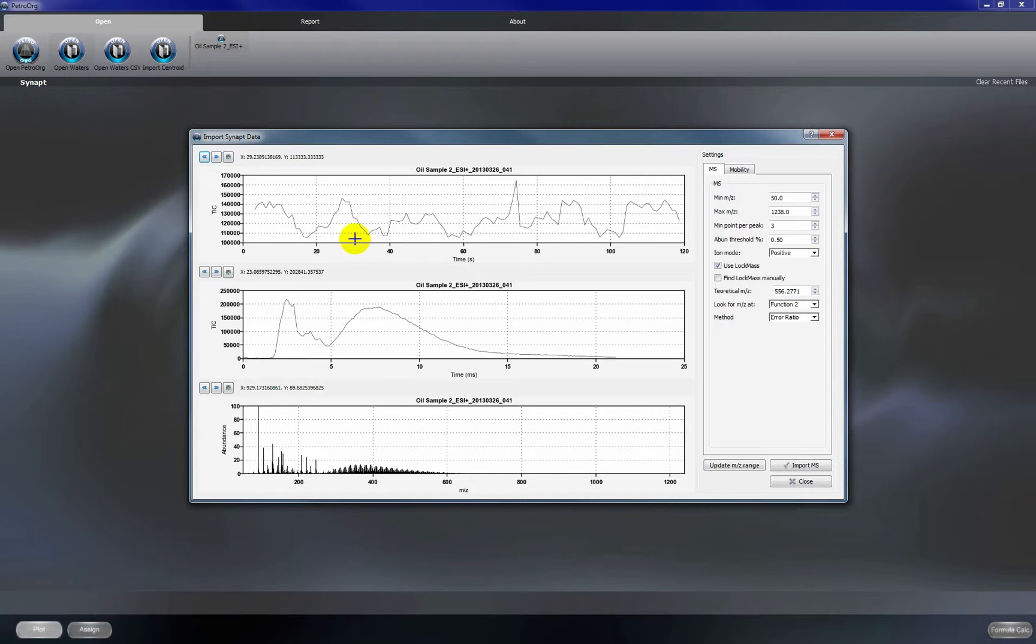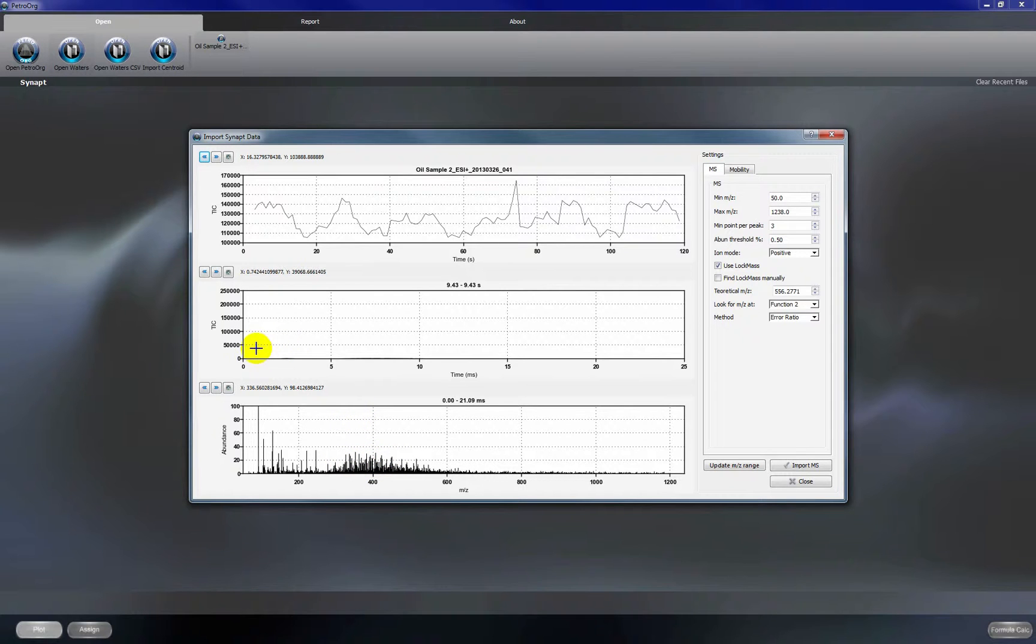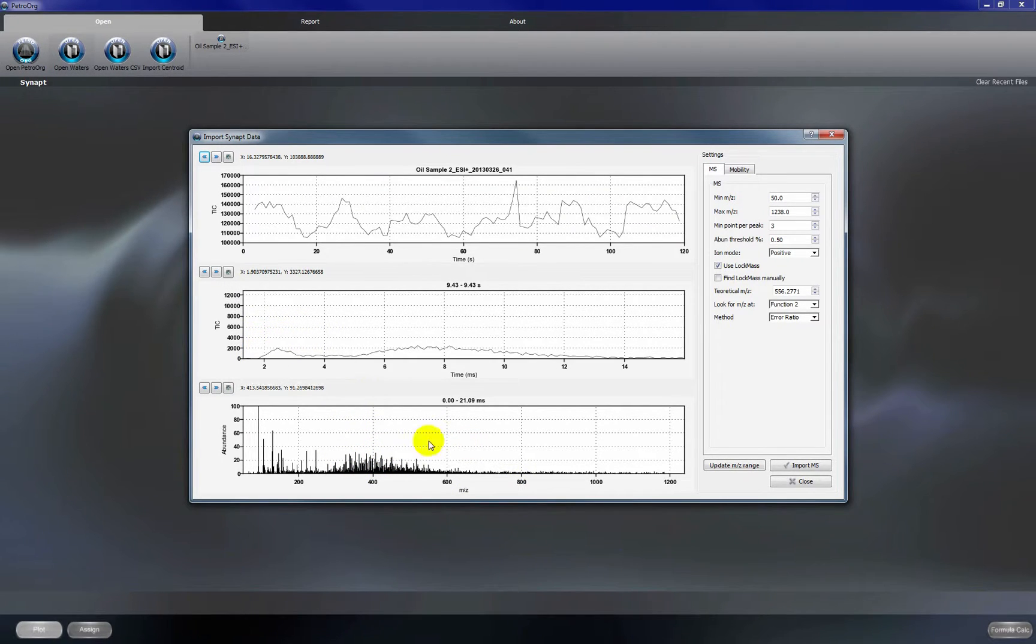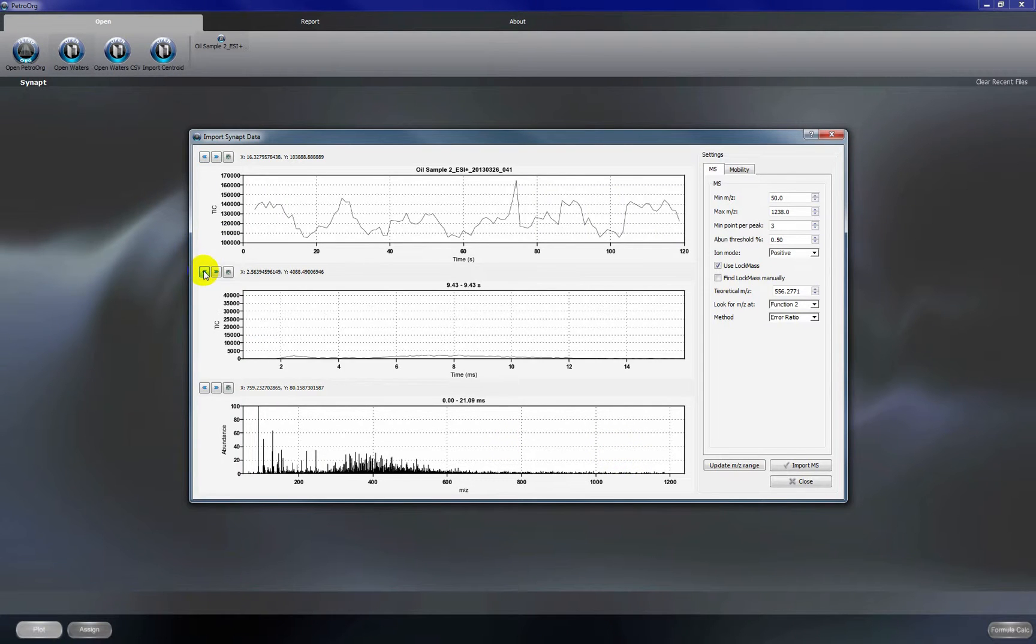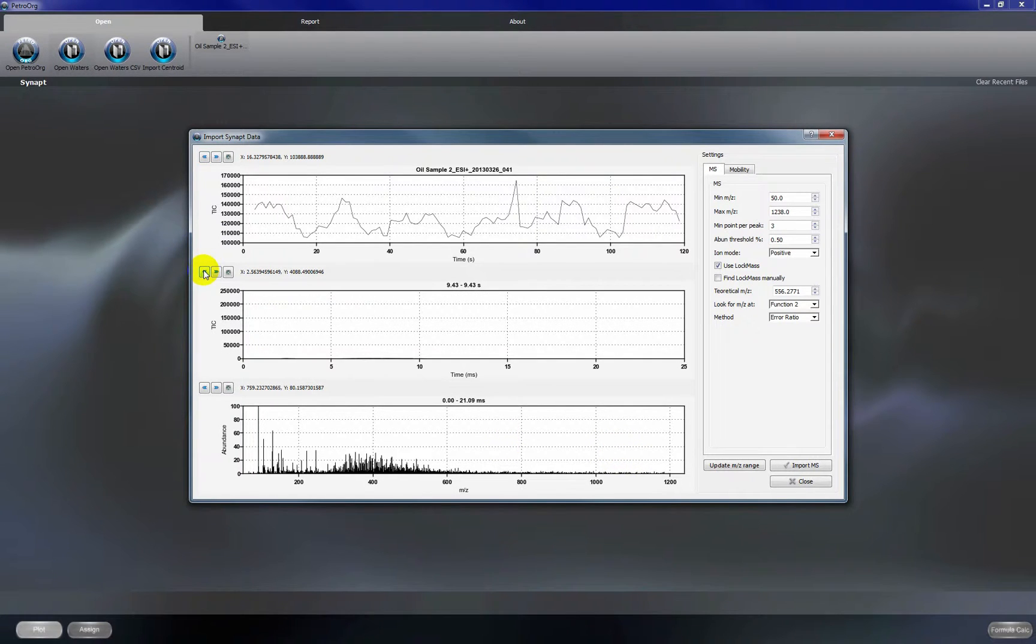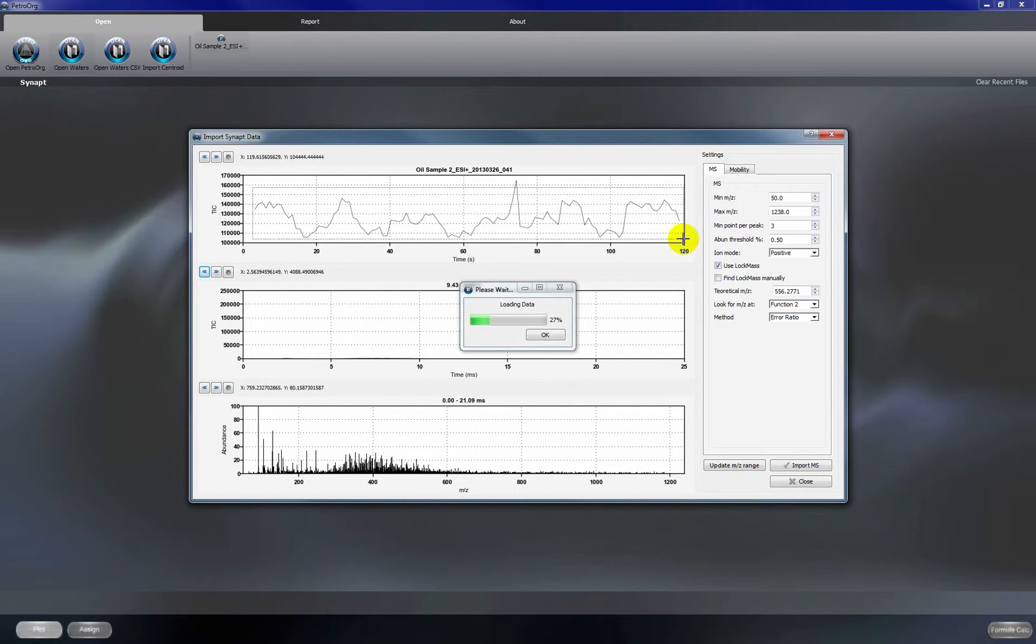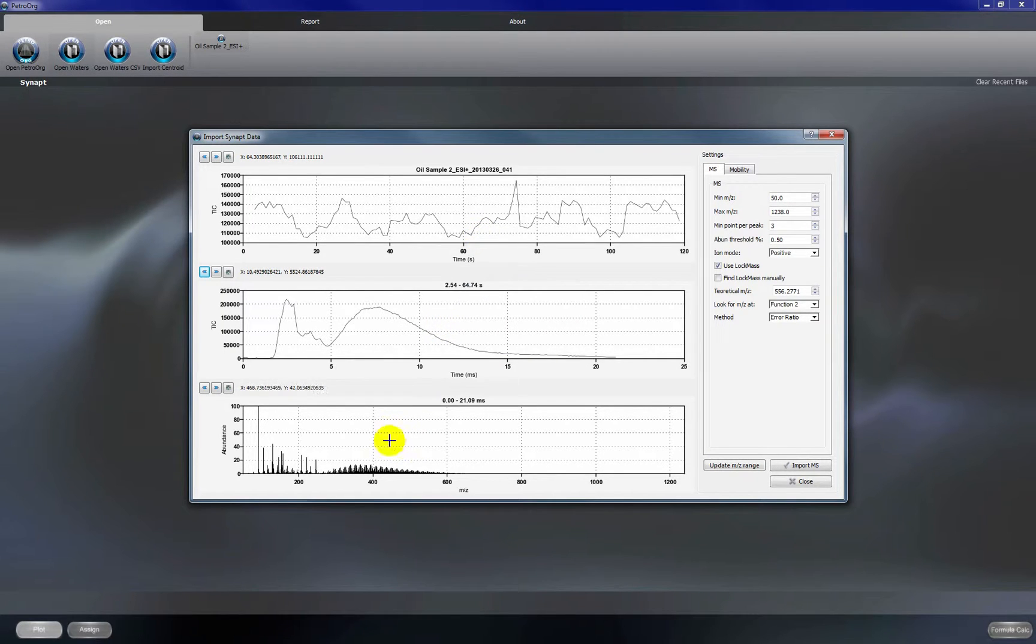If we want to look at a single scan you can right click on the chromatogram and this will show you a single scan mass spectrum. If you zoom in you'll see the single scan mobilogram. If you want to sum the data again you will right click and drag across the chromatogram and this will give you both the summed mass spectrum and the summed mobilogram.